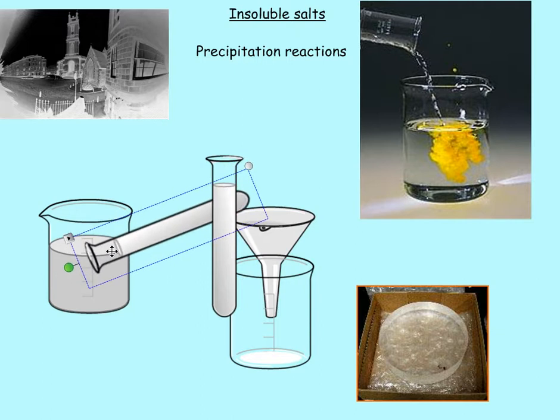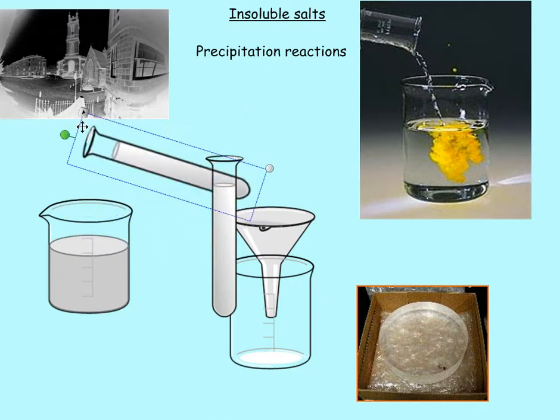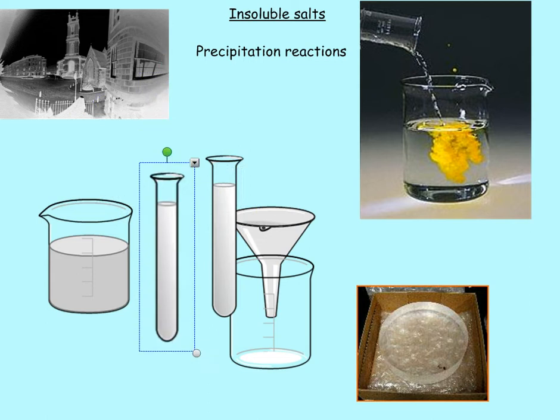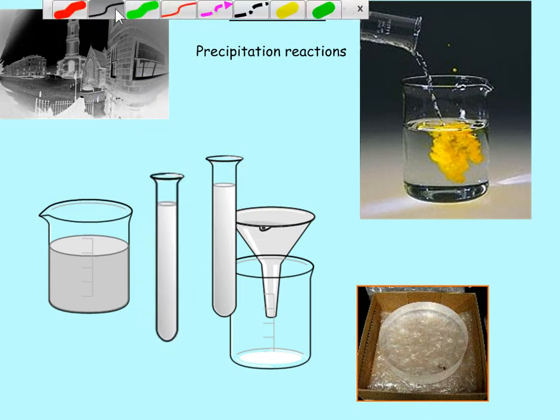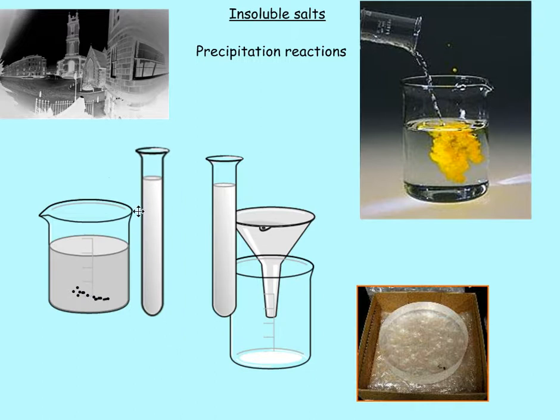I've poured it in there and we end up with a beautiful precipitate called silver chloride. That silver chloride is a precipitate formed from the two solutions — the sodium chloride and silver nitrate have reacted to make silver chloride.